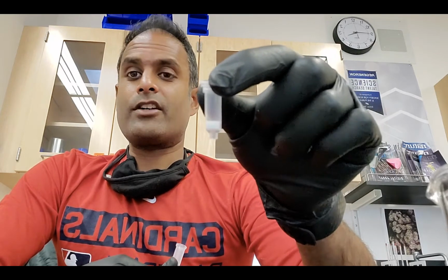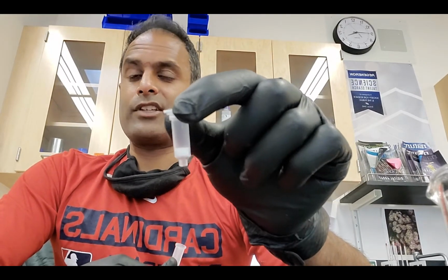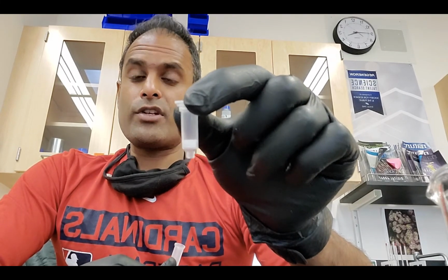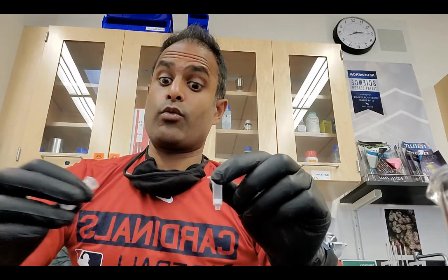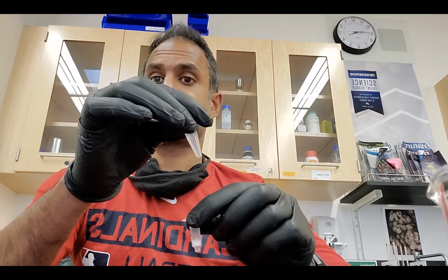I'm going to try to drop it out of there using an elution buffer. And that's the thing you have to listen for. So the elution buffer is going to be the one that drops your DNA out of this filter, and you're going to want to put that in a labeled tube that you can store. Cool? That's pretty much everything.